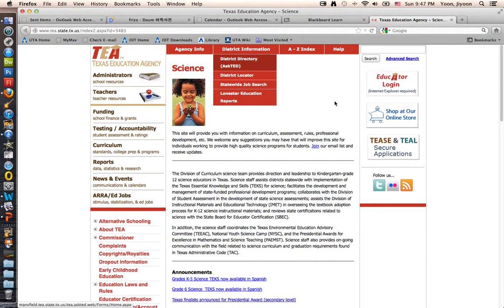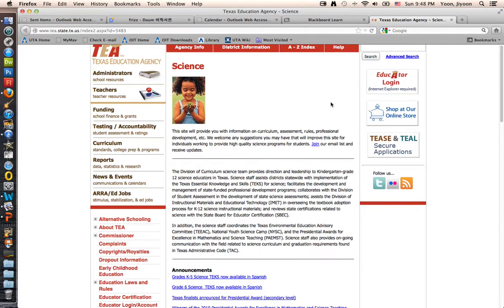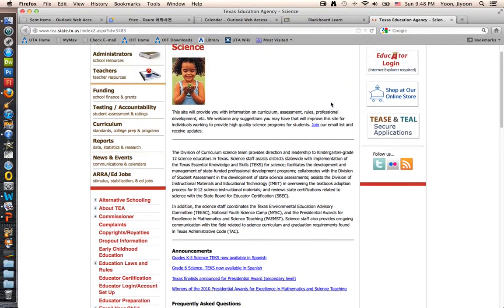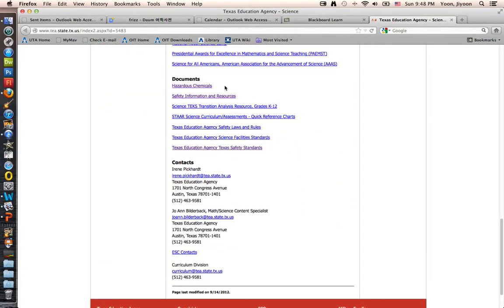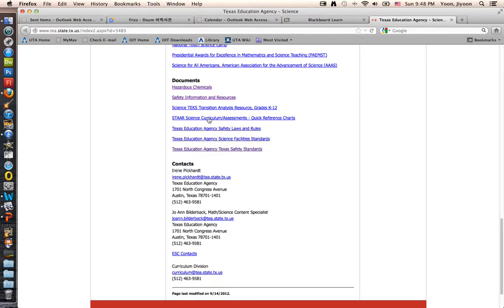Okay. Yep, this is the TEA, Texas Education Agency website, especially for science. And when you pull further down, you will see documents, hazardous chemicals, safety information resources, science tech transition analysis resources, STAAR Science curriculum assessment, Texas Education Agency safety law and rules. So all these are good resources for safety. And then Texas Education Agency Texas Safety Standard.